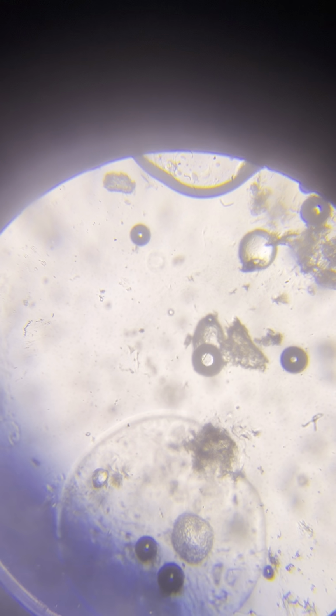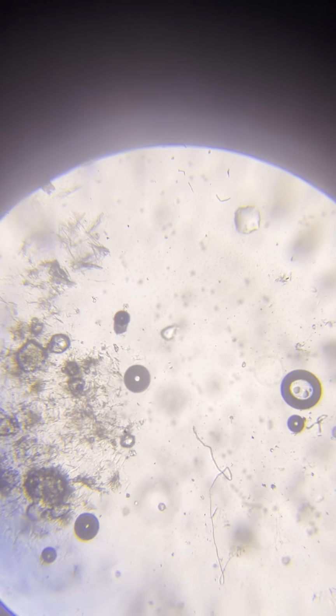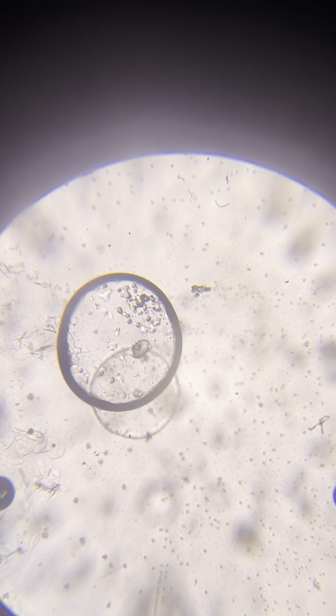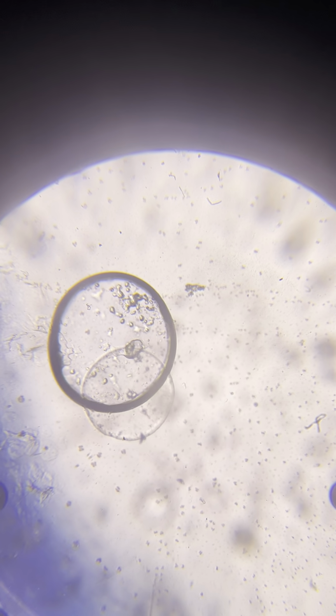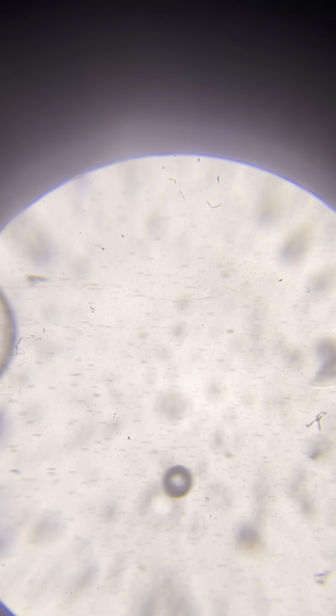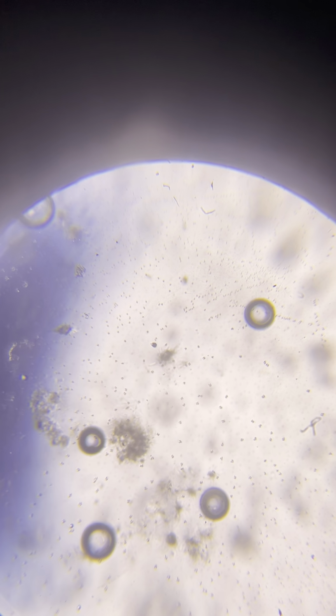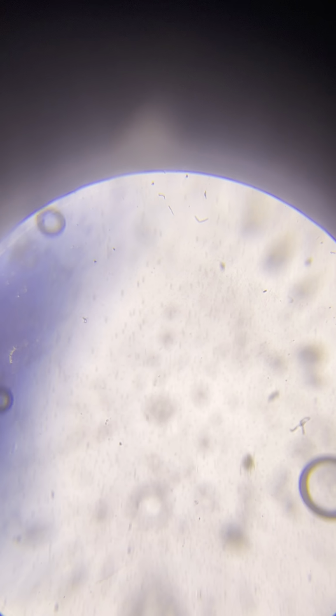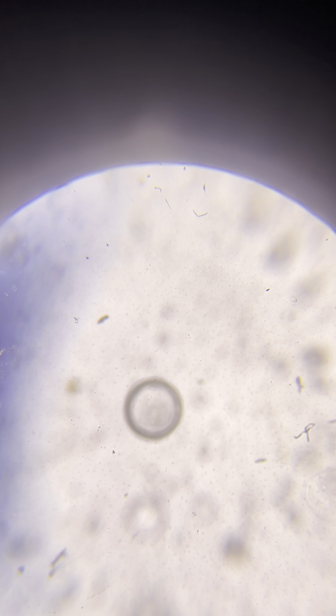And we have also seen the enterprise class. So all of that hints to me that the sodium bicarbonate additive was very, very successful. So we should add it, maybe even as a standard to every container from now on, especially sealed containers that have the problem of lack of oxygen.